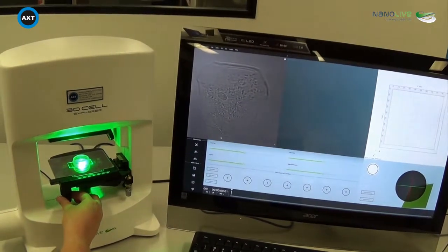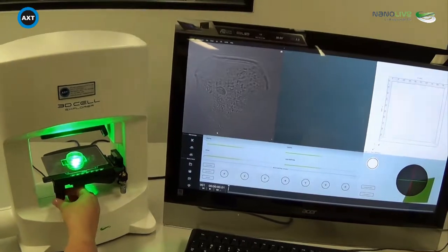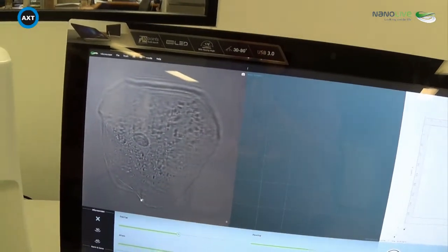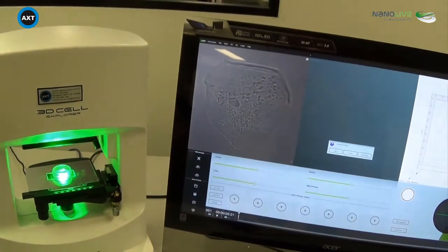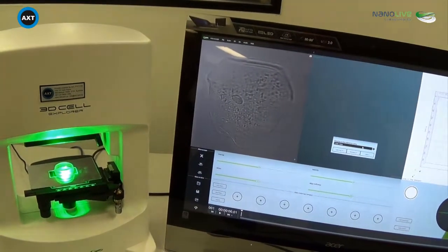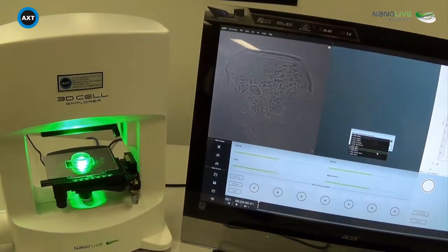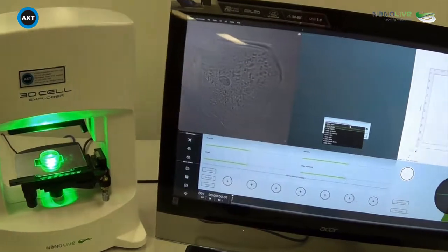Now you can see that you've got a nucleus, membrane and lots of vesicles and other things within the cytoplasm. So in order to get a 3D image of this cell, we simply hit the 3D single shot button. We're then able to choose what mounting medium the sample is in, and there's a list of various media that you would usually use or buffers that you usually use for sample. In this case, I know that it's in water.